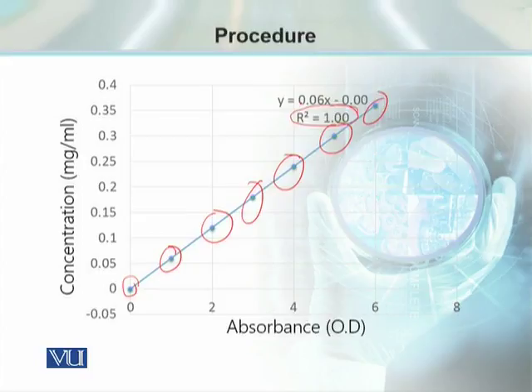अब हमारे पास दो किस्म के स्पेक्ट्रोफोटोमीटर्स इस वक्त एग्जिस्ट करते हैं, एक बेसिक स्पेक्ट्रोफोटोमीटर और एक लेटेस्ट स्पेक्ट्रोफोटोमीटर जिसमें हमने कंप्यूटराइज सेटअप और इंस्टॉलेशन कर दी है. In those systems, we can make this standard curve once, and then we can use this standard curve as a reference every time we want to see the concentration of proteins. And in that case, we don't get the optical density, we get directly the concentration of protein per milliliter or per microliter of the sample.